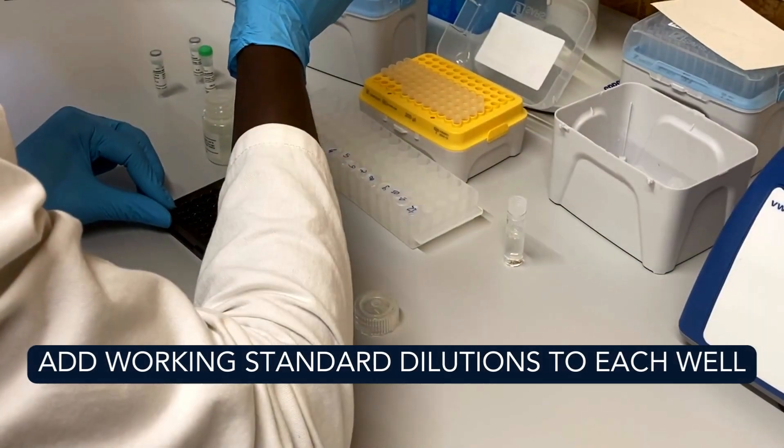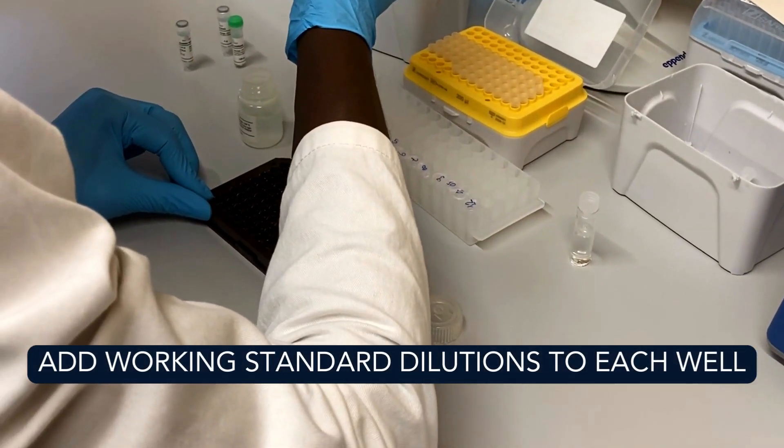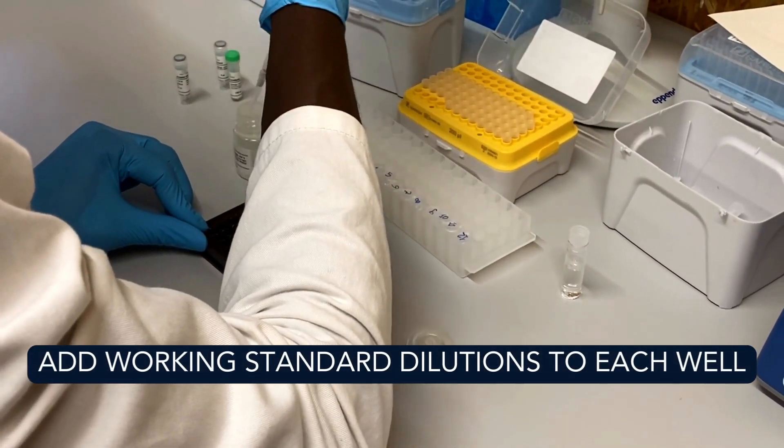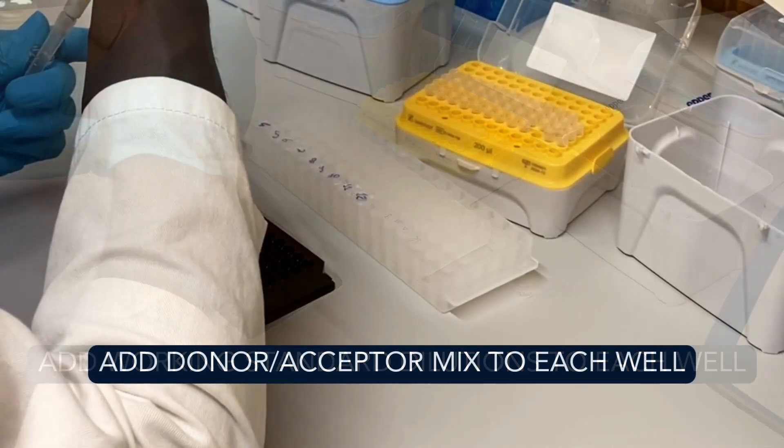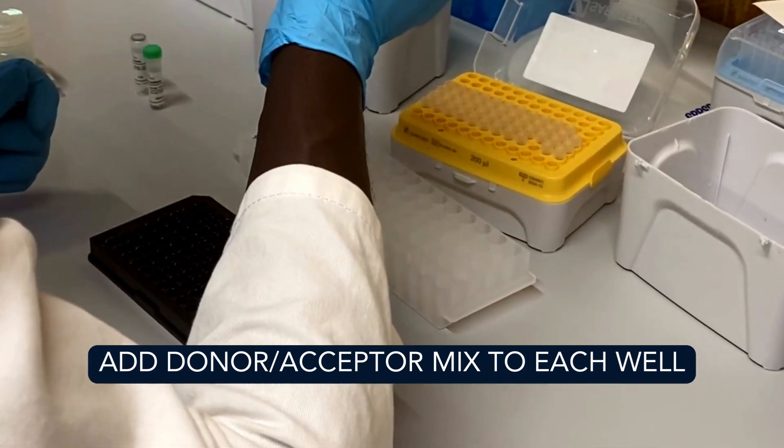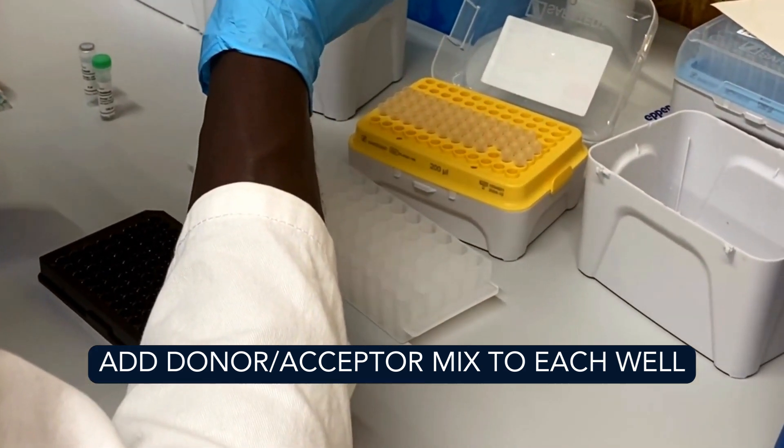After preparation of the IgG standard, start the assay protocol. Add 30 microliters of working standard solutions to each well of the black microplate, then add 100 microliters of donor-acceptor mix solution to each well.